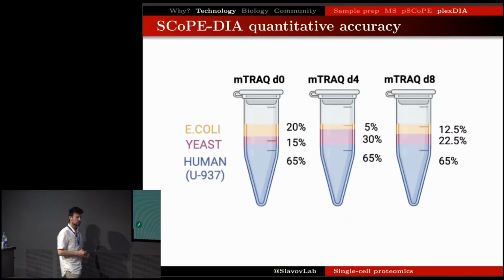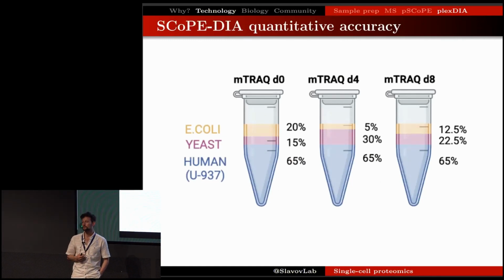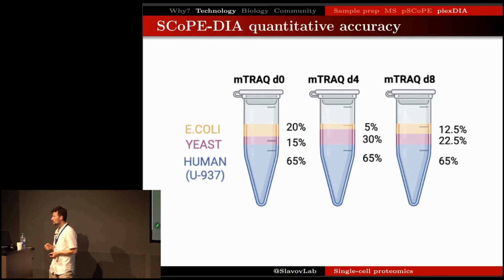And we have encountered challenges of being able to do it in a robust way and to not undermine the quantitative accuracy. It's very easy to introduce a carrier and increase the depth of protein coverage. In some ways, that's a strong expectation, but it also has the potential to undermine quantitative accuracy, as indeed some of the published examples show.